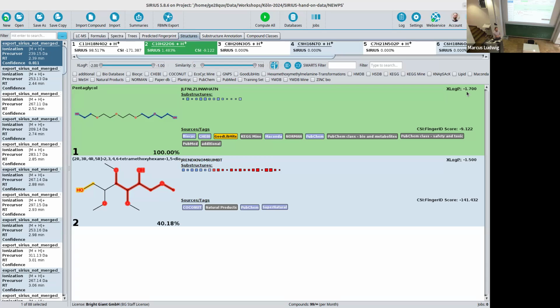In principle, the method should decide on its own if there are good edges in there or not, because it uses a different scoring for the edges. Just use everything. But the important thing is to use it only for biological data, or data where there is some biotransformation. If there are independent compounds which have nothing in common, you shouldn't use it.